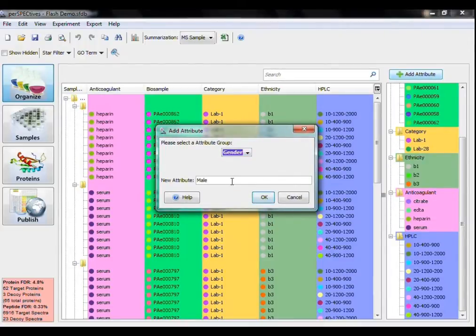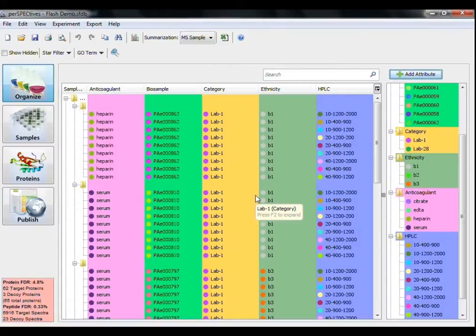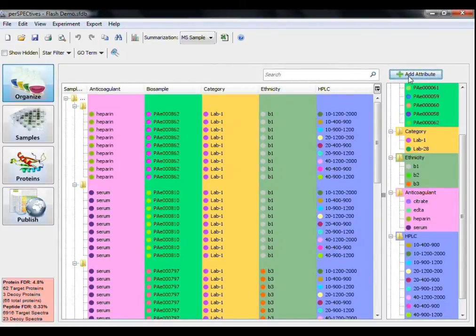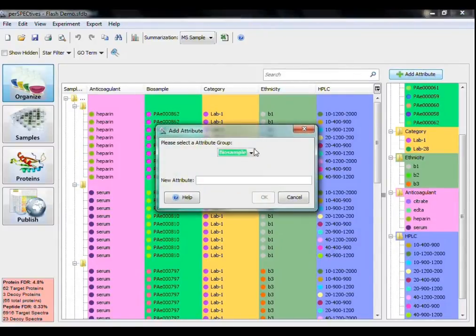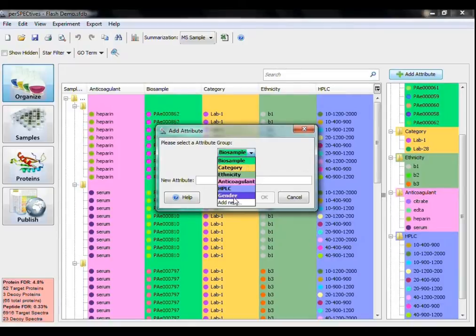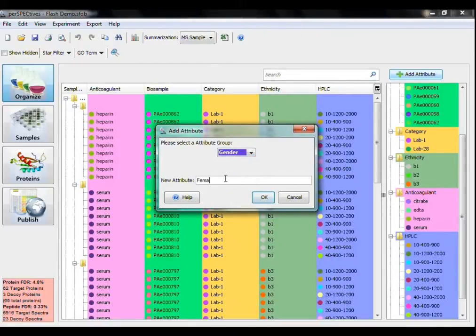If I want to define more than one attribute for the group, I have to click Add Attribute again, and then select the attribute group from the drop-down menu. Then I can define the new attribute below.